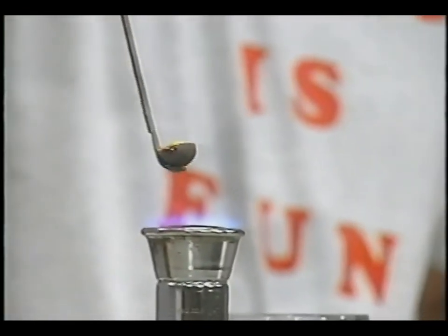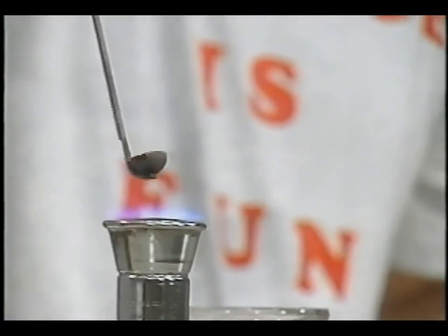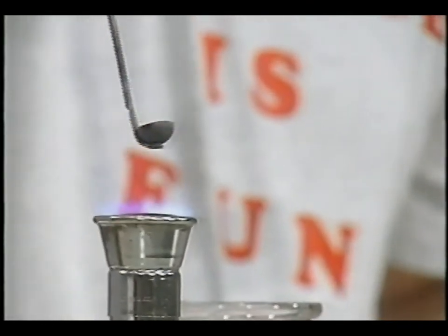It combines with the oxygen to form sulfur dioxide. Once it starts burning, we'll see a blue flame. Maybe if we can dim the lights, we can see that blue flame better. There. And now I will take this and put it inside this flask. You see that glow is because of the sulfur combining with the oxygen to form sulfur dioxide.